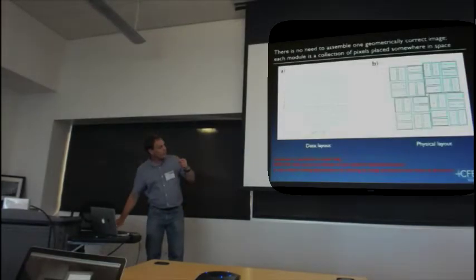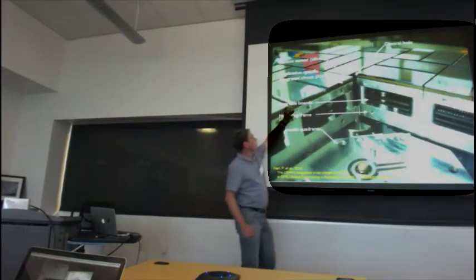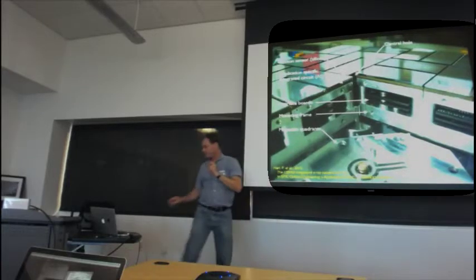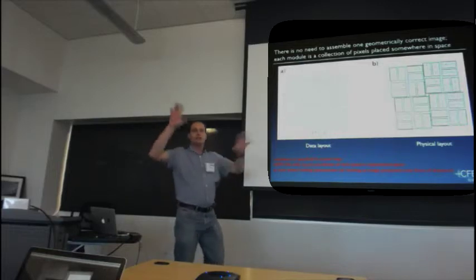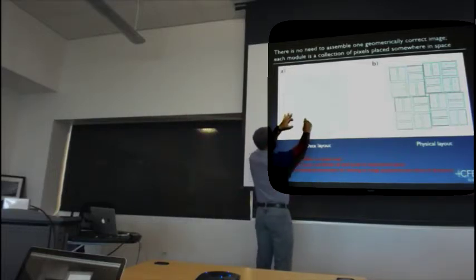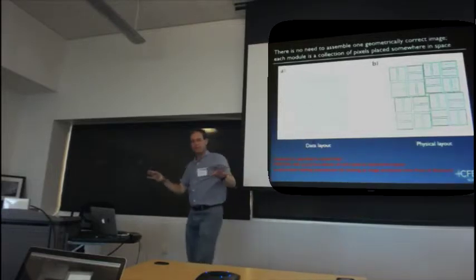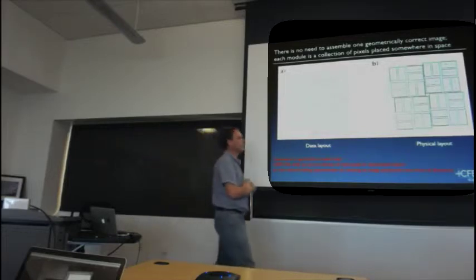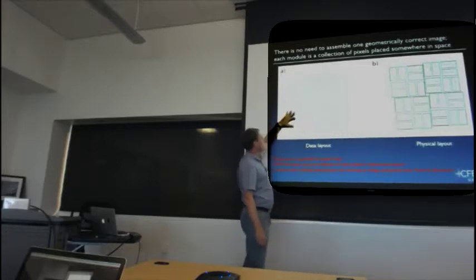But one of the things that happens with this detector, when each of these electronic modules here, you just read out the data and dump it into a slab of memory. So when you look at the data, it's not neatly arranged into a 2D detector with all the geometry applied. It's just chunks of memory. It's like, here's one, 2 by 1, here's the next, and it's just in chunks of memory. You don't know where it is in space. It's not nicely assembled. You have to do that yourself. And you can do that if you want to look at it. But for analysis, it doesn't actually matter a damn.